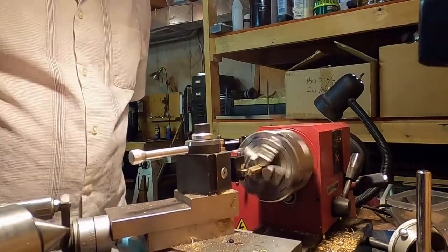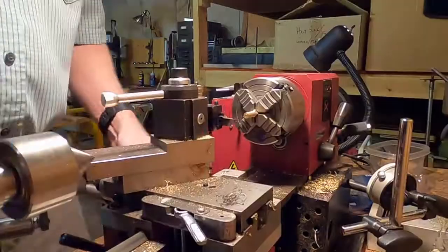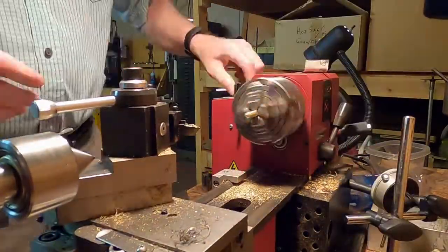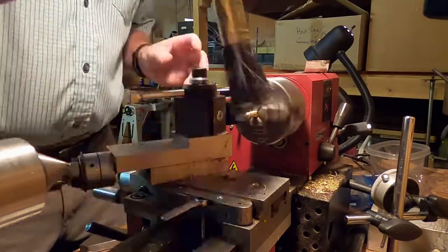When turning is completed, a file is used to clean the surface. Next, a different tool is used to cut a round end onto one end of the rod. The idea here is to cut a finial on the end of the rod that will match the finials on both the weight tray and on the individual weights themselves.